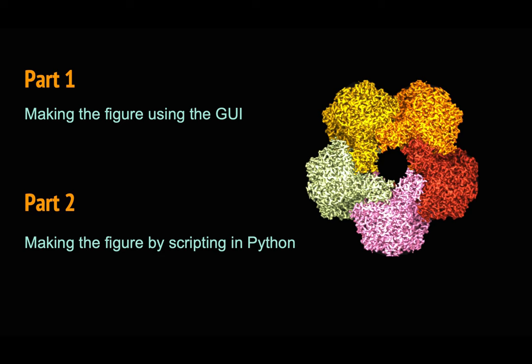In the first part we are going to make this figure by using the GUI, so I will show you the new graphics feature, the new menu to have better representation of our macromolecules and map. In the second part we are going to write a Python script using Coot to make the same figure.